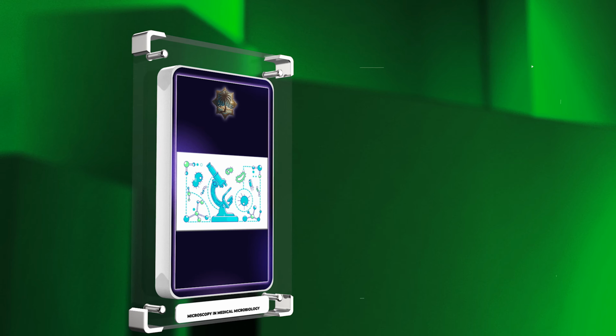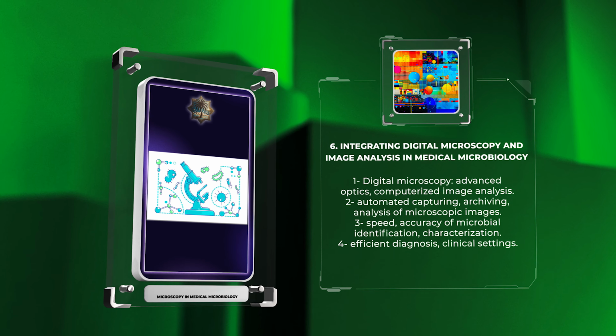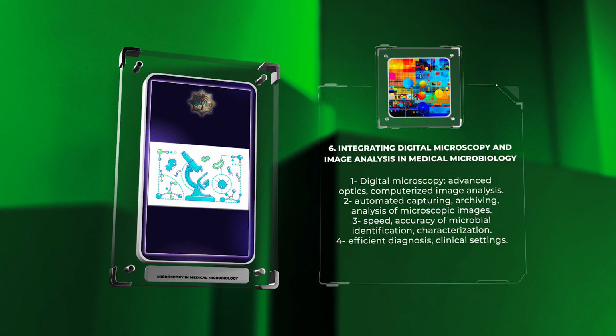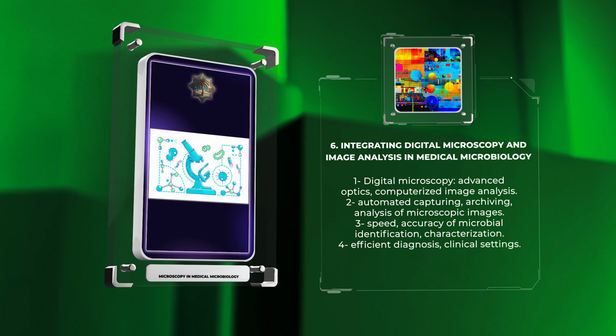Digital microscopy combines the power of advanced optics with computerized image analysis. It allows for automated capturing, archiving, and analysis of microscopic images. This integration enhances the speed and accuracy of microbial identification and characterization, facilitating more efficient diagnosis in clinical settings.